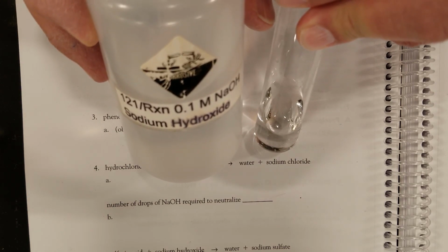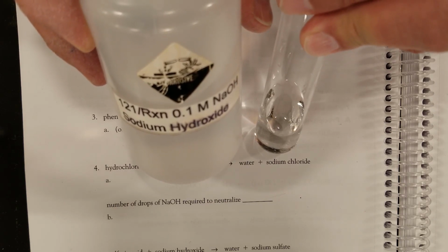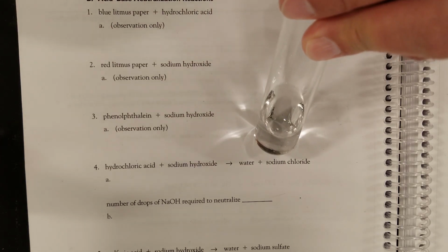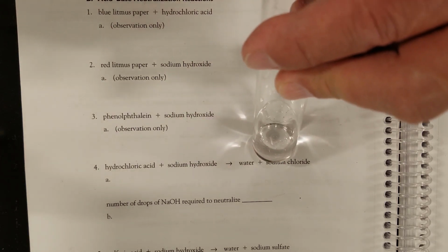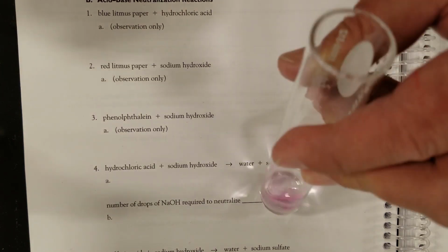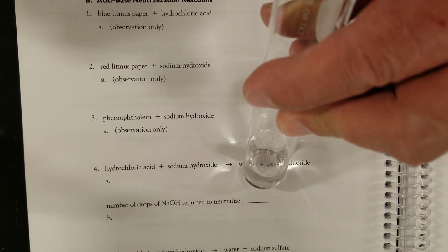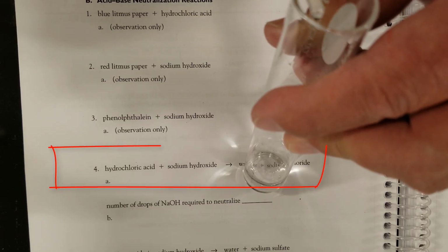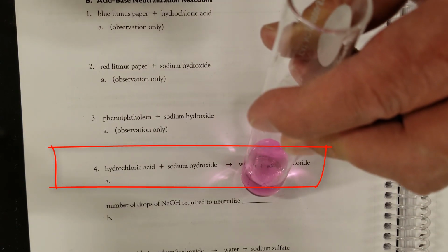From your lecture, you should know an acid and a base, they're opposites of each other. So this hydrochloric acid should react with the sodium hydroxide. They react with and they neutralize each other. And there I've added a few drops, and oh, it still isn't basic. 1 more drop of the sodium hydroxide. Hey, now it's basic.